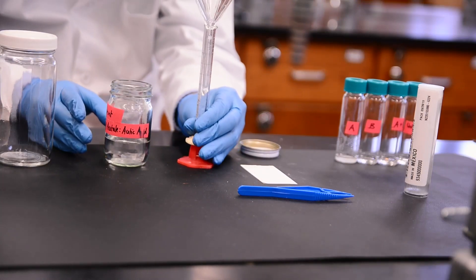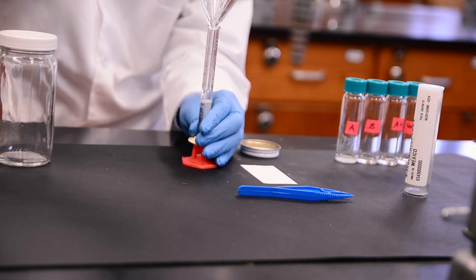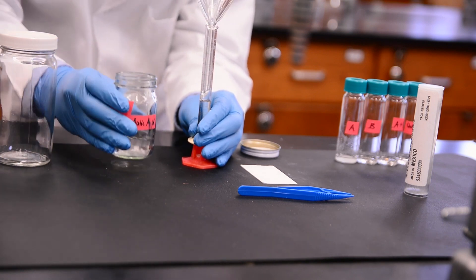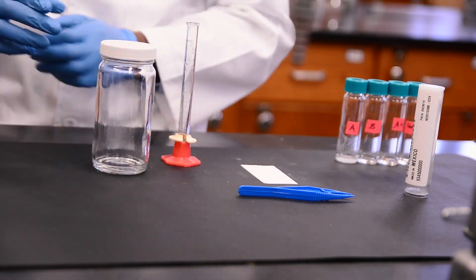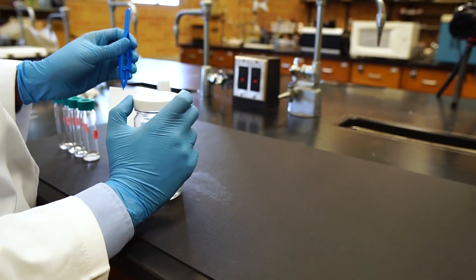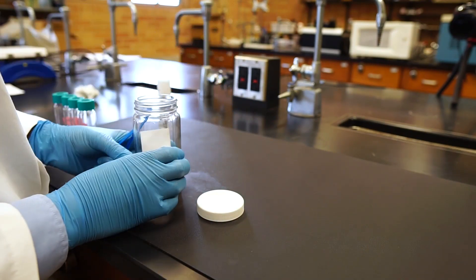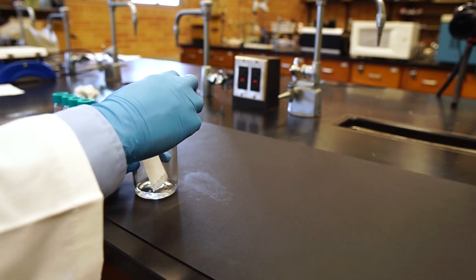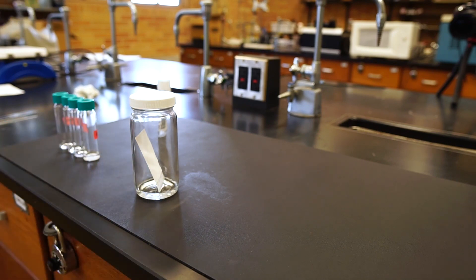Now let's prepare the TLC chamber. We'll need about five milliliters of the solvent. The solvent amount will vary depending on the size of the chamber, but for this small container, five milliliters is enough. After adding the solvent, cap the chamber for a few minutes. Using forceps or tweezers, let's grab our TLC plate and gently place it into the chamber. Again, it is very important that our solvent sits below the sample line on the plate — you don't want the solvent to touch your sample at this point, or it will wash into solution and you can't run your plate. After introducing the plate, immediately close the cap and wait.